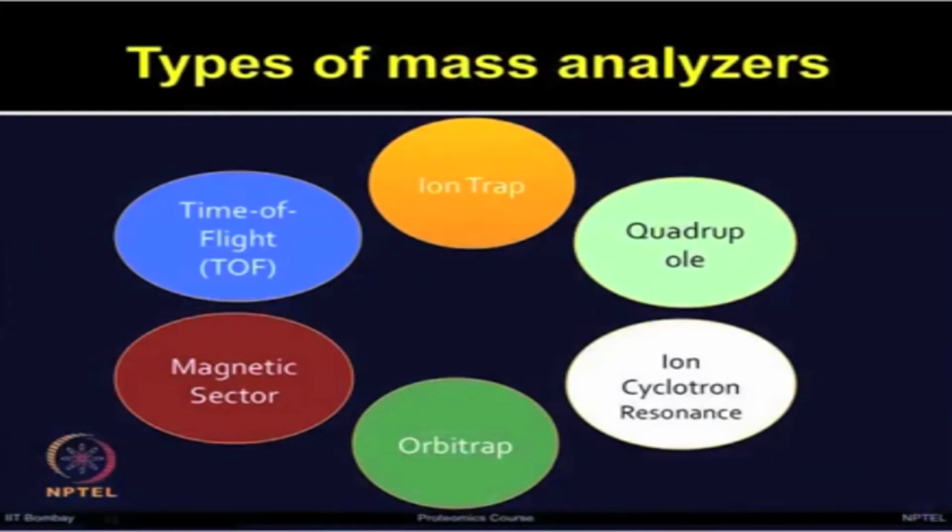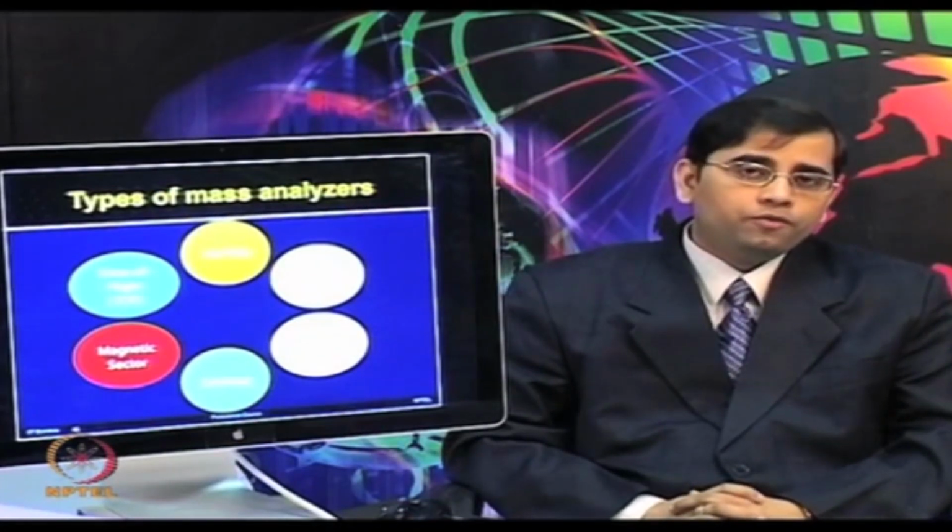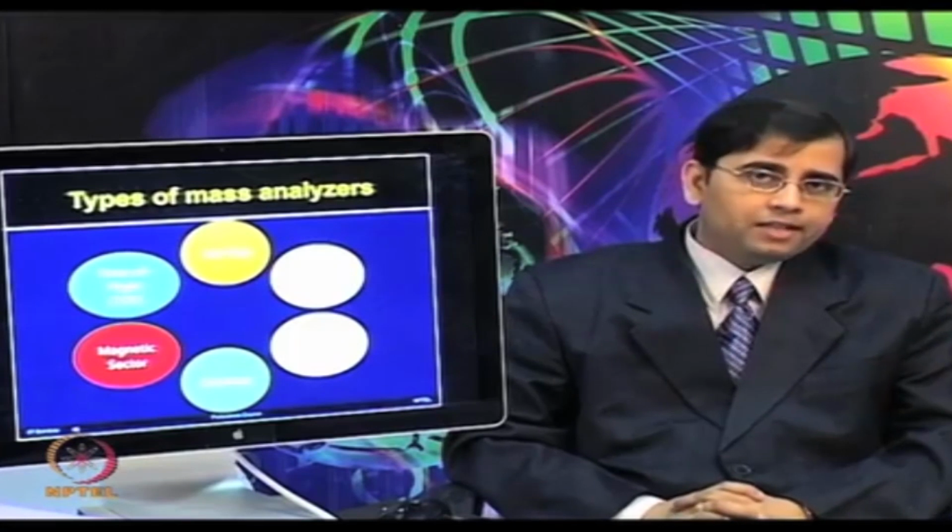In the previous lecture, I gave you an overview of the different types of mass analyzers currently available. Each of those has its own unique properties in mass range, analysis speed, resolution, sensitivity, ion transmission and dynamic range. The time of flight analyzers use time of flight, while ion trap, Orbitrap and ion cyclotron resonance separate ions based on their mass to charge resonance frequency, whereas quadrupoles, or Q, use an oscillating electrical field for selective stabilization of ions. This gives you an overview of the various types of mass analyzers and briefly their principles.